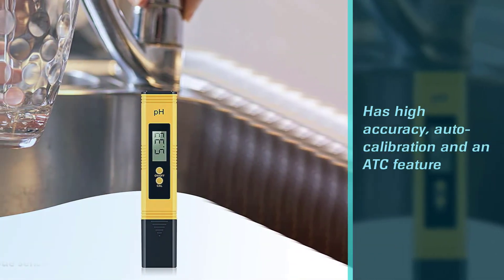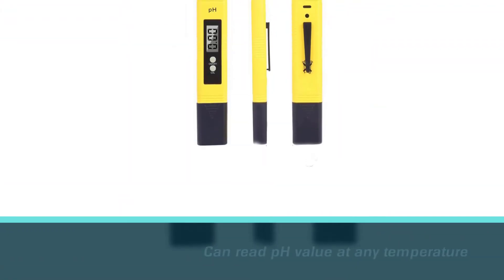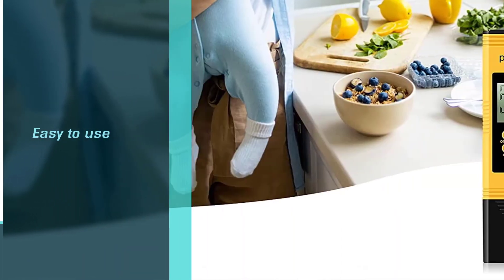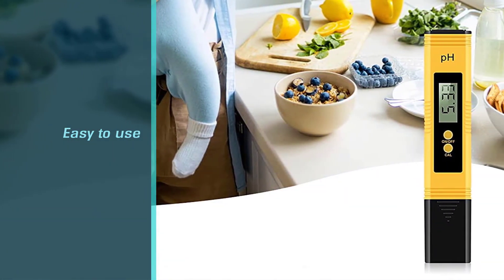This pH meter is easy to use: remove the protective cap and insert the meter's electrode into the water you want to test, then turn it on. It is ideal for home or laboratory use, drinking water, swimming pools, aquariums, fish tanks, RO systems, or hydroponics.